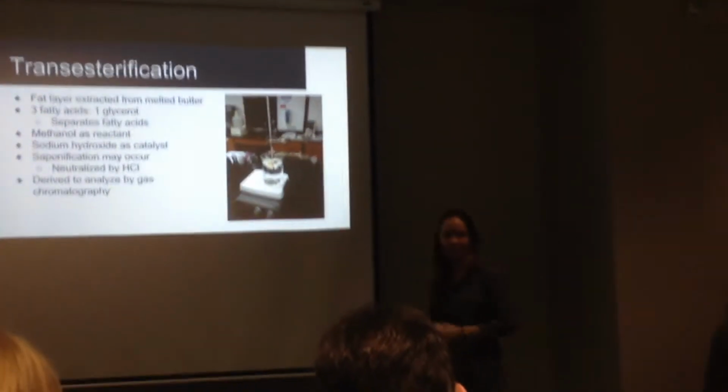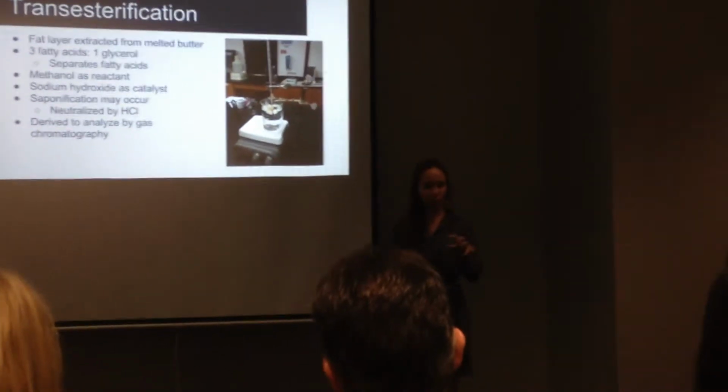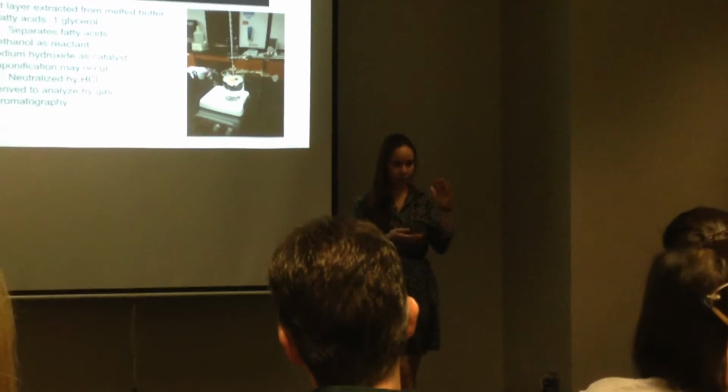Okay, I'm Victoria. I'm going to talk to you about transesterification. This is a process we use to separate. First, we take the butter and melt it, and then you get a fat layer and a water layer.